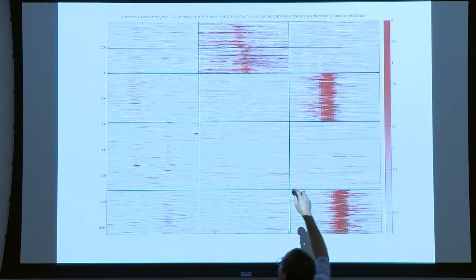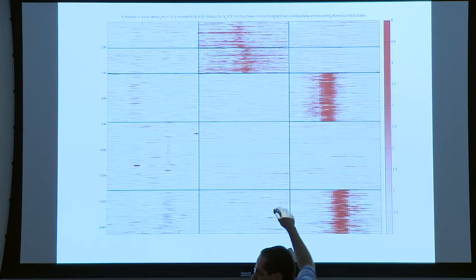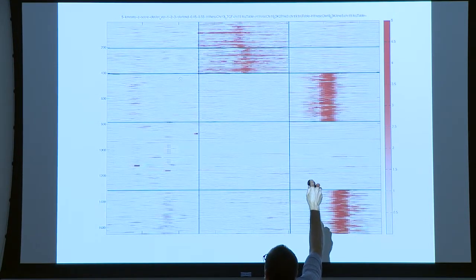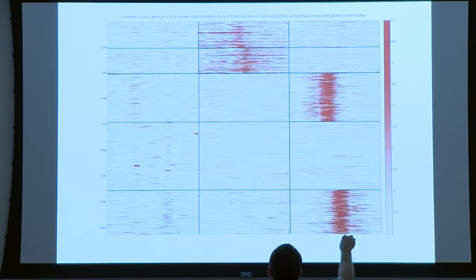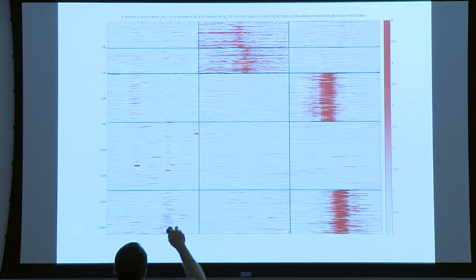So what you see here is the whole cell extract on the left, CTCF in the middle, and K4ME3 on the right. Now, each line is exactly the same genomic area, which are the regions that we defined by the bed file.